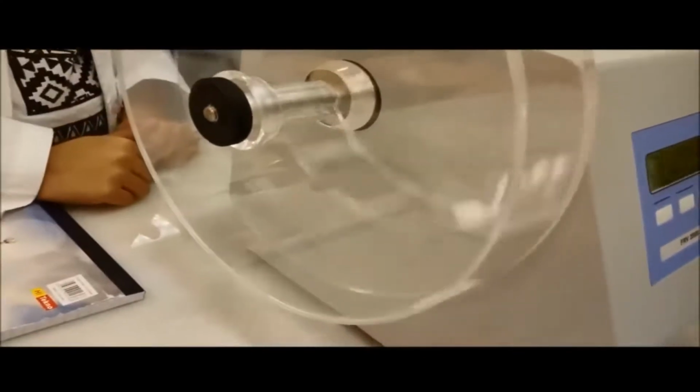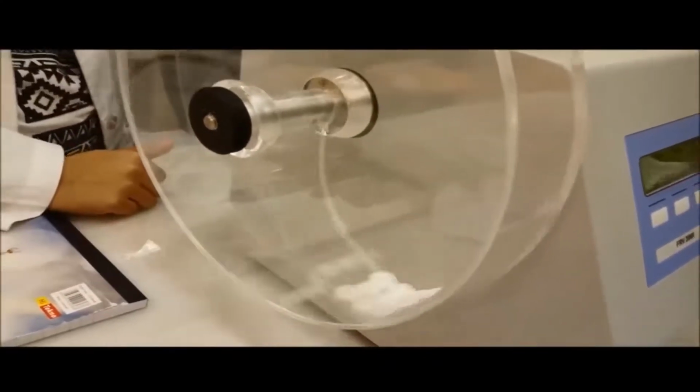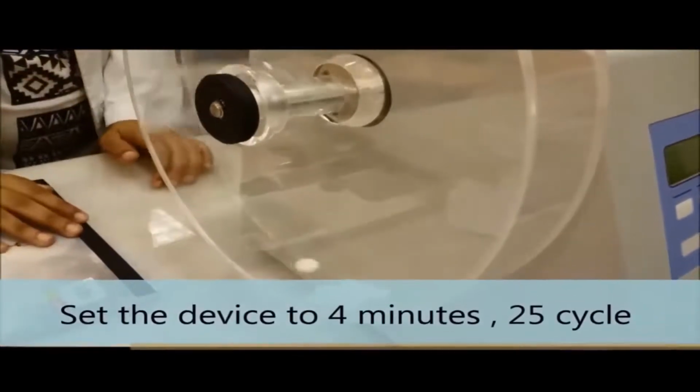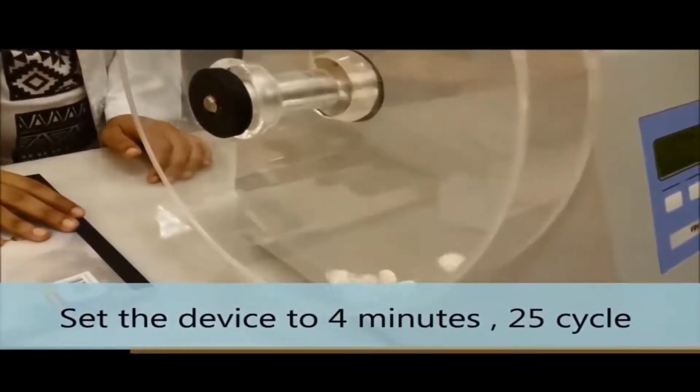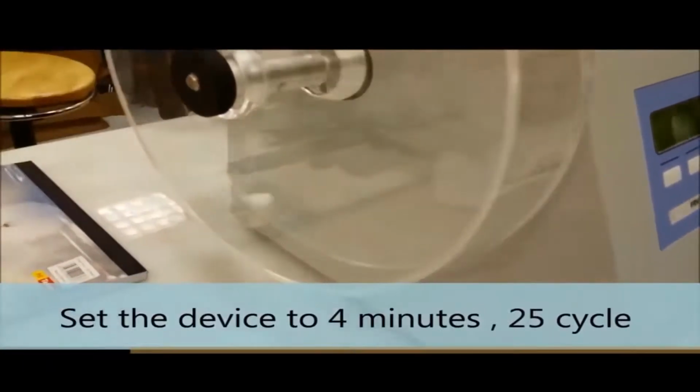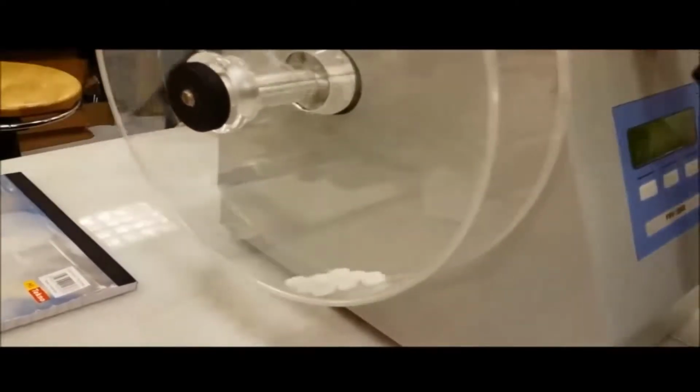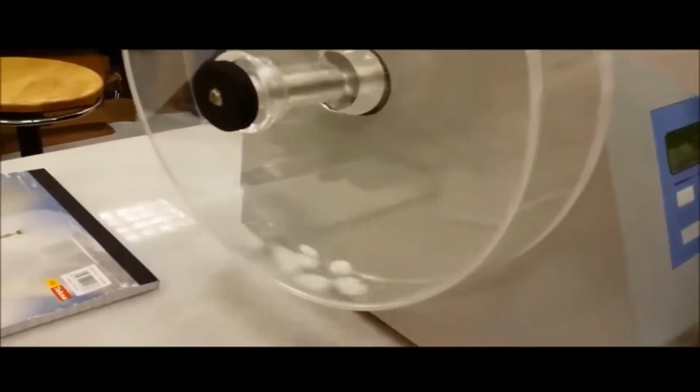Because this may vary depending on the tablet or the salt, the strength. So here you can see this is going on, and after completion of the total cycle, we need to weigh the tablets, calculate the weight, and find the difference between initial and final.